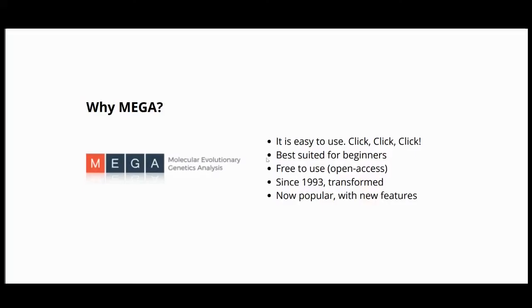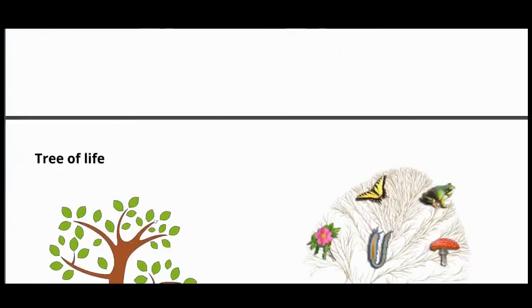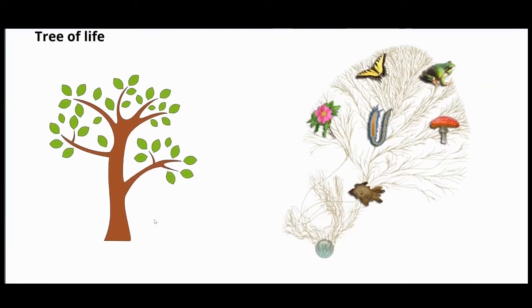Why am I teaching Mega? I mean, there are many other programs, but why am I so focused on Mega? I teach Mega because it is easy to use. Well, it's just about click, click, click, and it is best suited for beginners, and it is free to use, as I told you earlier. And since 1993, it has transformed with new features actually. Therefore, it's quite effective with all the tools now.